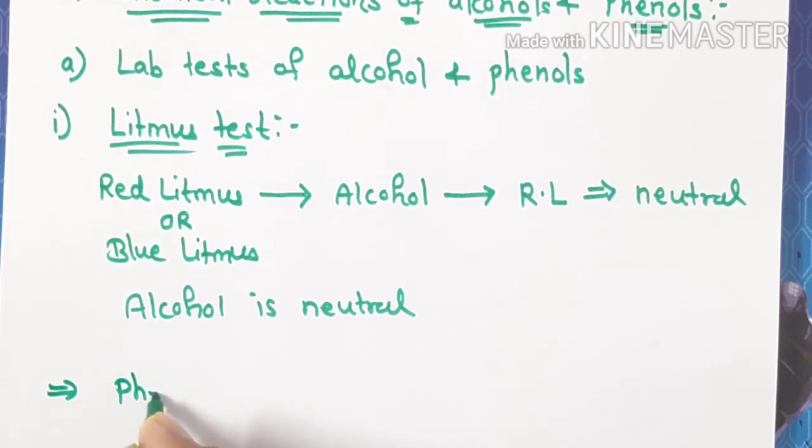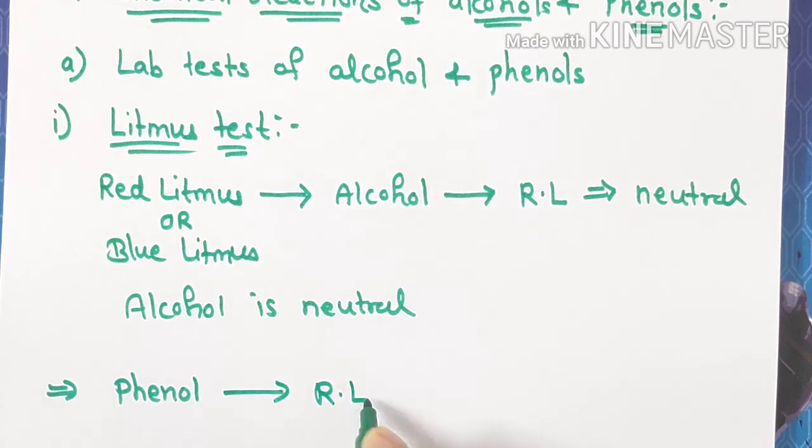Okay, now next I take phenol. In this phenol, suppose I add red litmus. What do I find? No change in color.